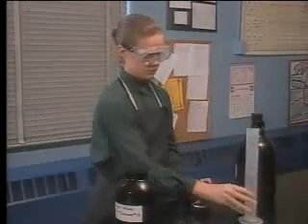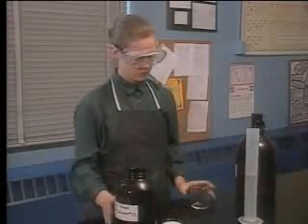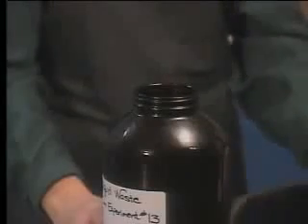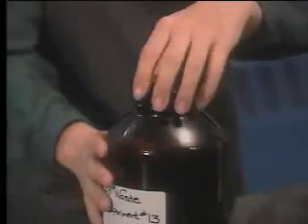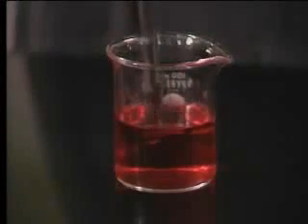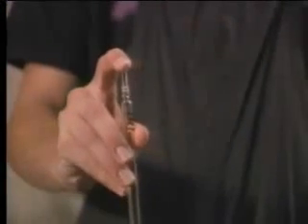After measuring out a reagent, you'll often have something left over. Instead of pouring it back in the reagent bottle, dispose of it in the proper waste container. When drawing out chemicals with a pipette, don't use your mouth. Use a bulb or pipetter. You can collect the exact amount you need and never have to come in contact with it.